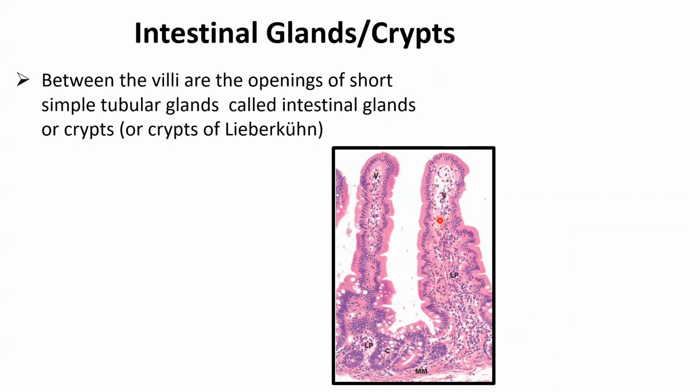Here, lamina propria. These cells are simple columnar enterocytes. Each cell will be covered by thousands of microvilli. So I have villi, microvilli. And if you look down here, this will be the plica circularis. So plica circularis will be covered by all these villi. The villi are made of cells, and the cells have microvilli.